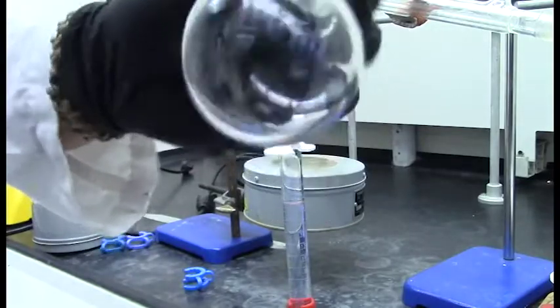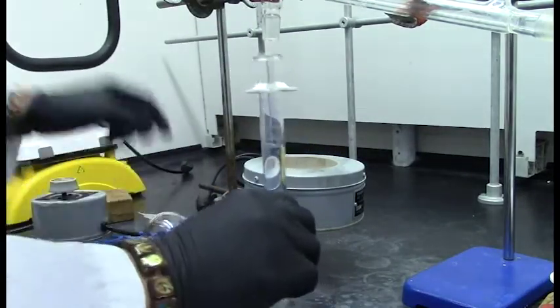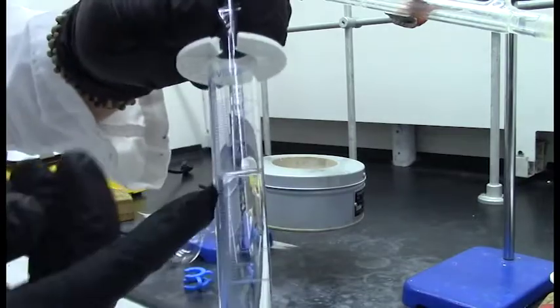Put the boiling chips into the round bottom flask, and then fill it with the mixture. As a general rule, it should be filled to no more than two-thirds of the flask.